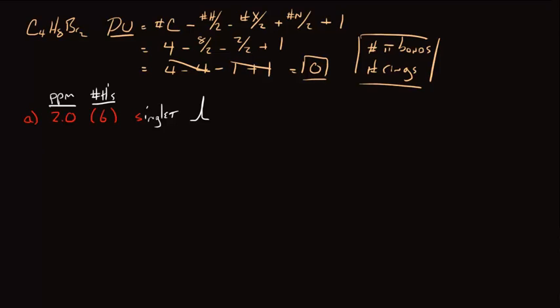Okay, so the second piece of data that we have is peak B, and this peak has a shift of around 3.9 ppm, and it integrates to about 2 protons, and it's also a singlet. So again, it shows up as a singlet.